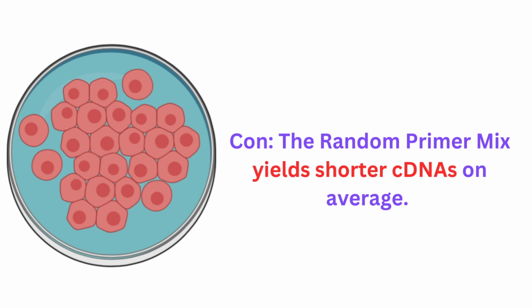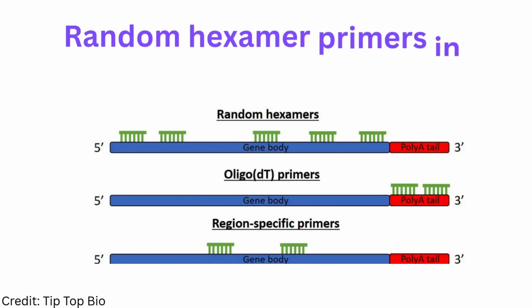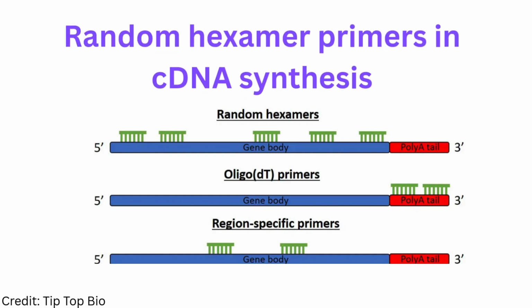You may also want to target a specific gene, and so you just give that primer at that complementary DNA stage. No need to put random hexamers or oligo-dT primers. As mentioned, typically your random hexamer mix is a mix of hexamers as well as oligo-dT stretches of thymine oligos. And so in this case, you get covering of the entire RNA templates, including your messenger RNAs and some non-messenger RNA sequences, polyadenylated RNAs.